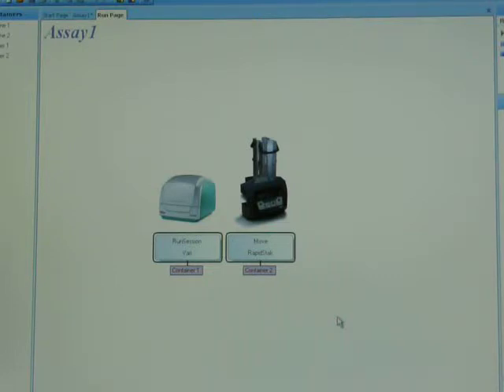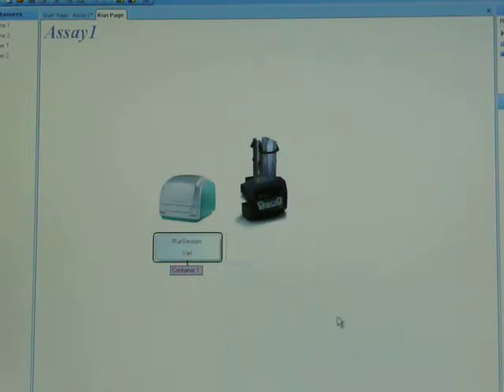This is a fairly short protocol, so I'm just going to let that run and we'll see what happens on the screen for plate 2.